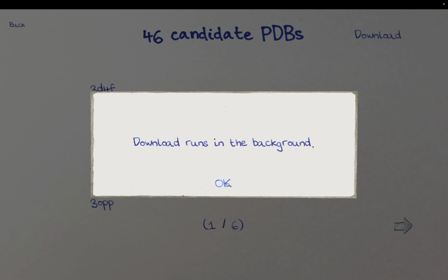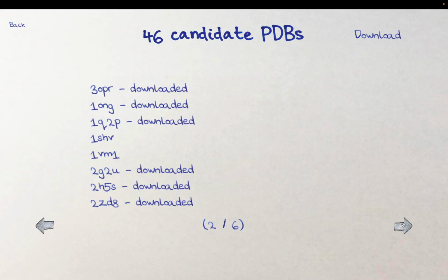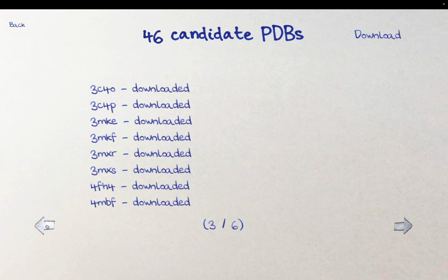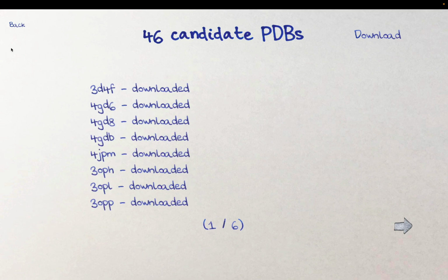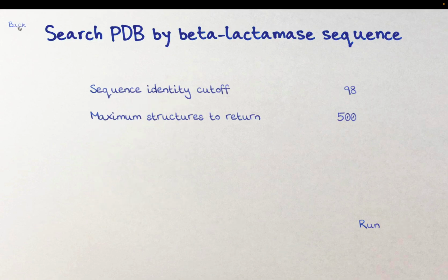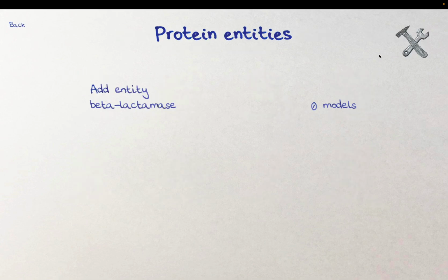This will run in the background. If we go from left to right, then we can start to see the files get downloaded and marked as such. I'm going through this very quickly because there is another tutorial which goes into this in more depth.